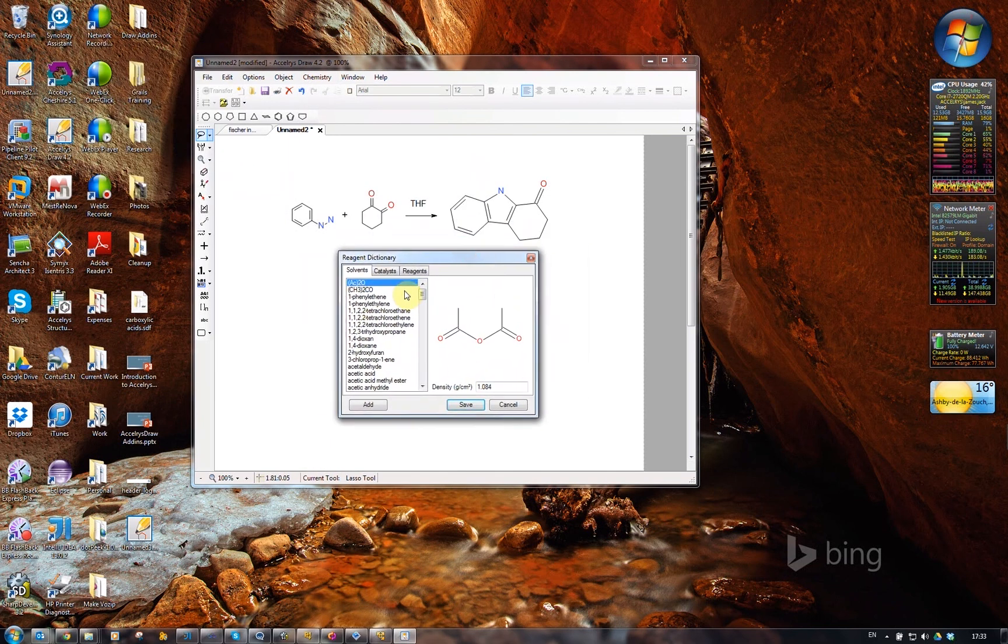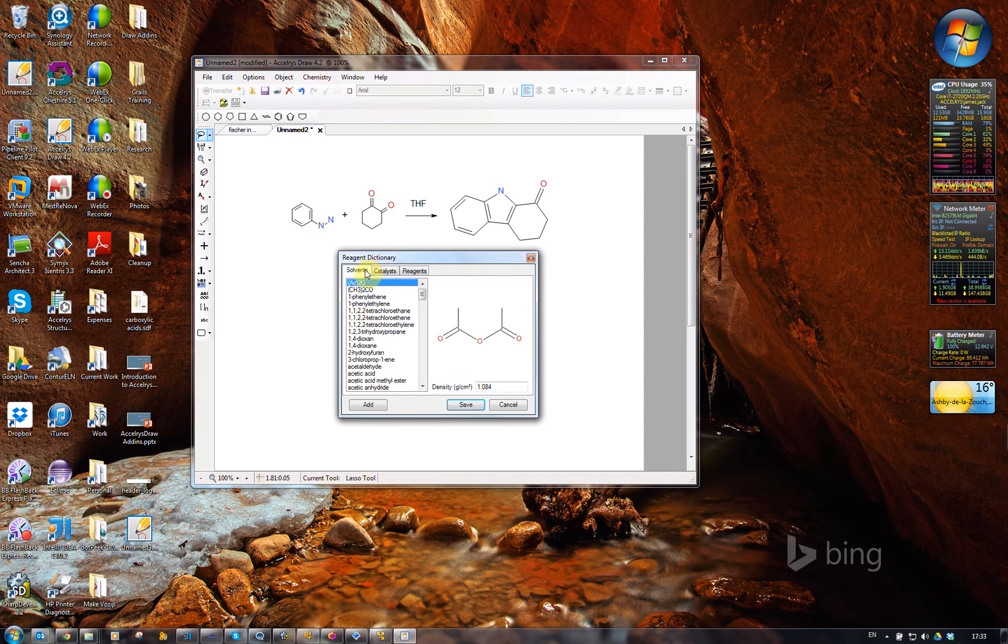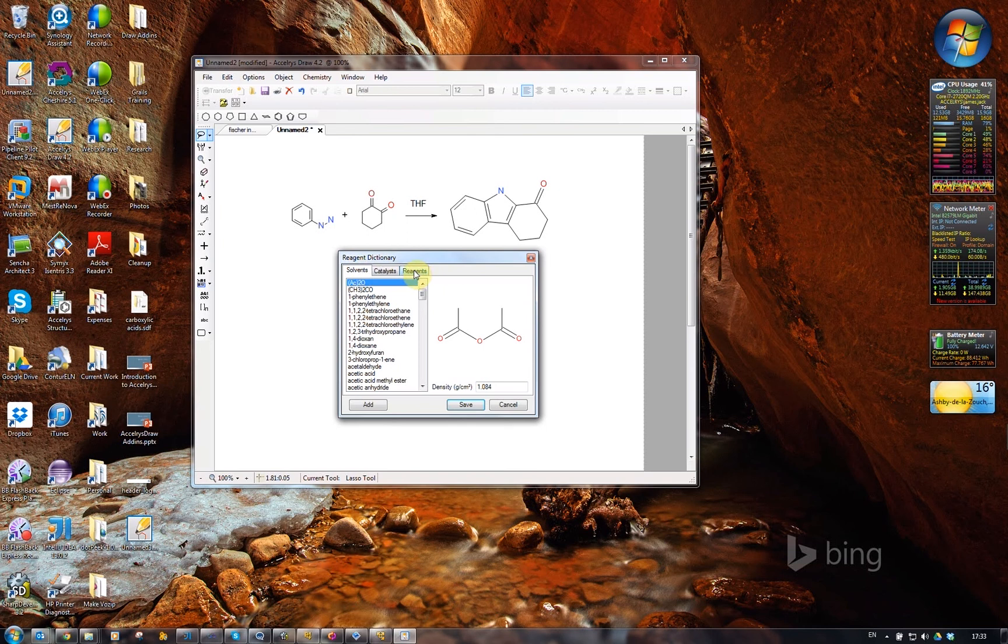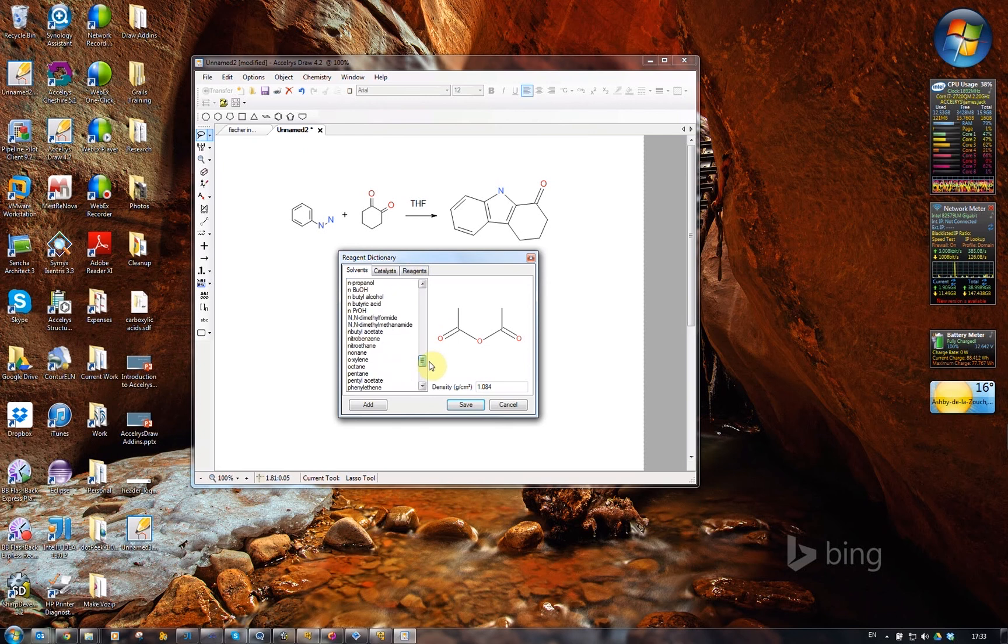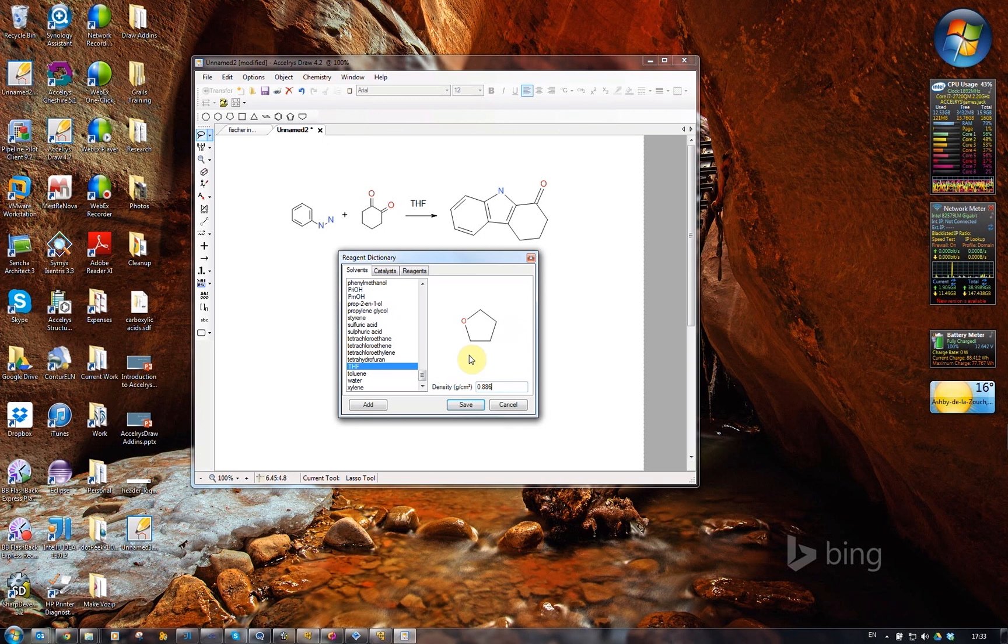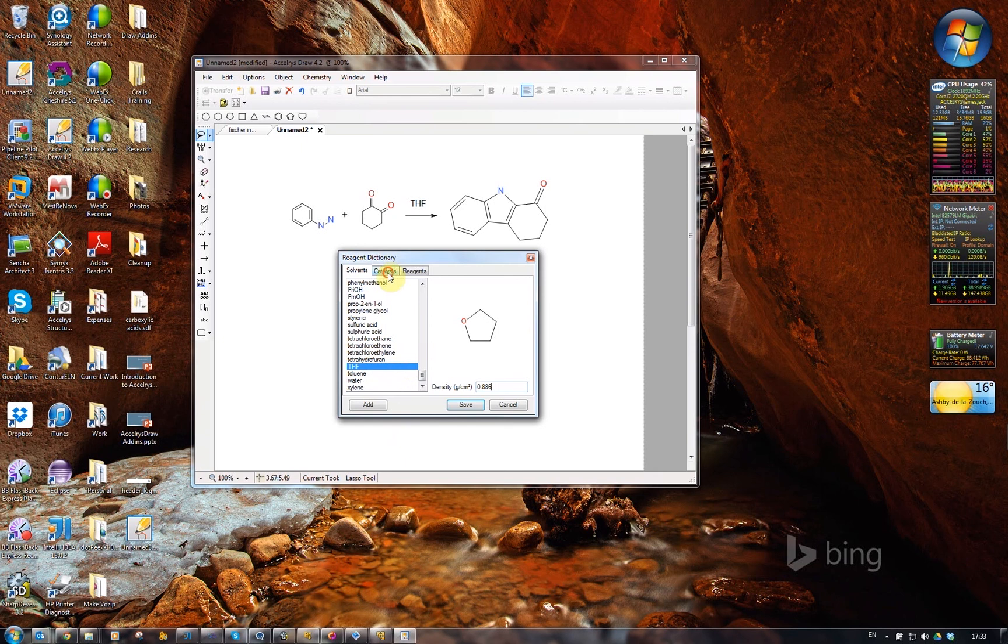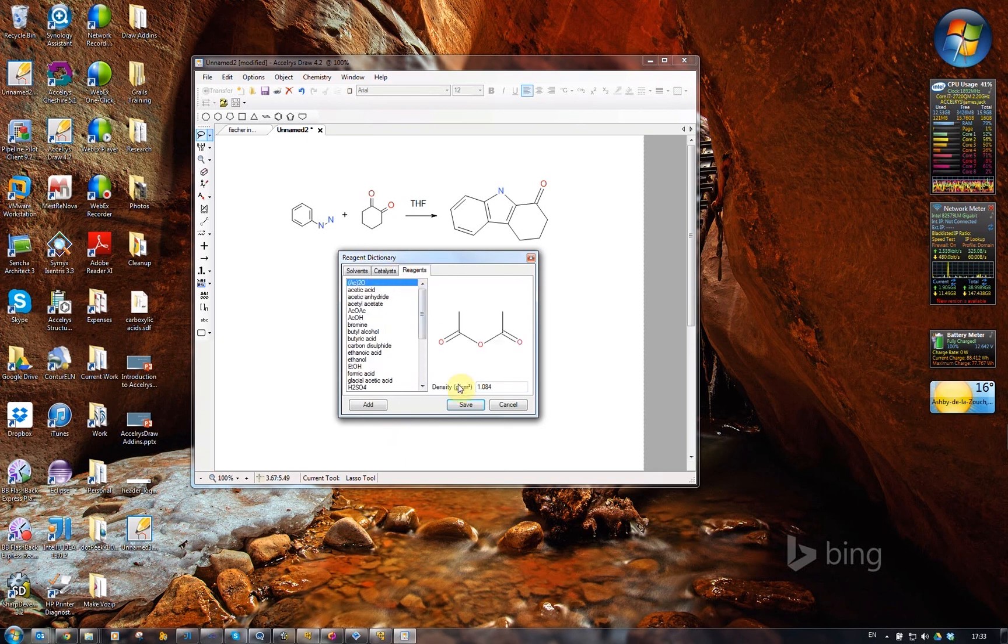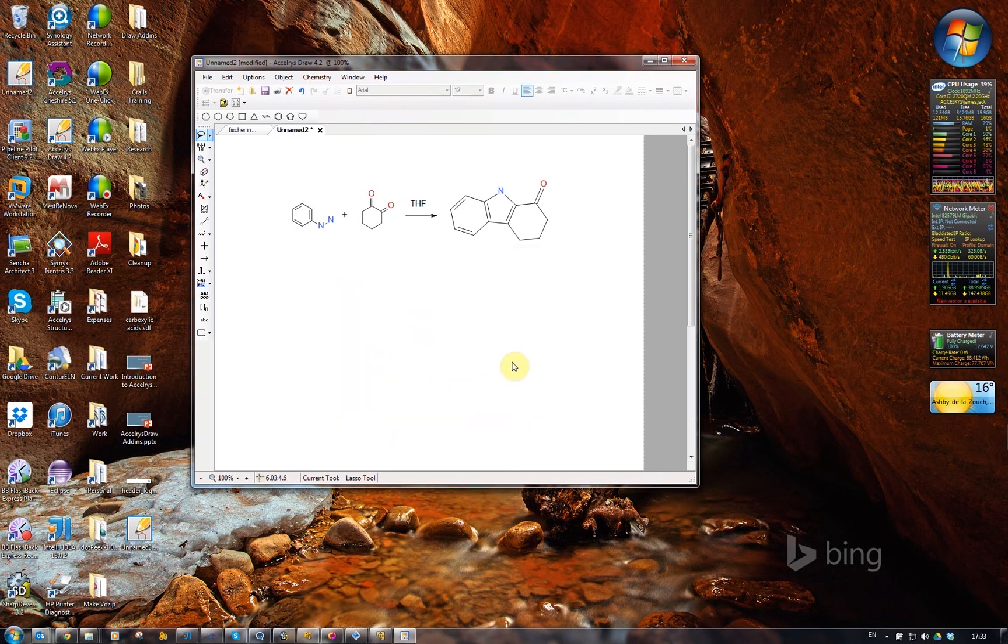Here it is. We define lists of reagents that can be solvents, catalysts, or actual involved in the reaction reagents. If I scroll down, you'll find there's THF. That's where it got the density from, that's where it gets the structure from. This is a dictionary that you can maintain and add to. And that's essentially it.